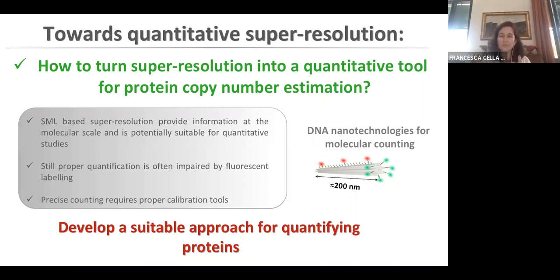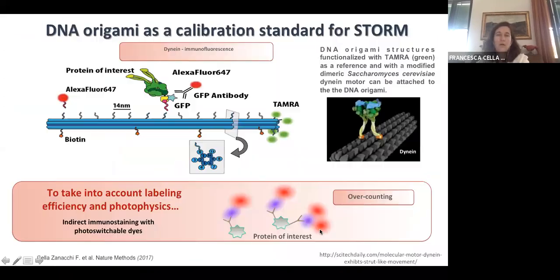And you can also implement this quantitative technique combined with light sheet microscopy in tissues. So the basic idea is that we can think about going and quantifying single proteins directly within the tissue. And this is really important and helpful.